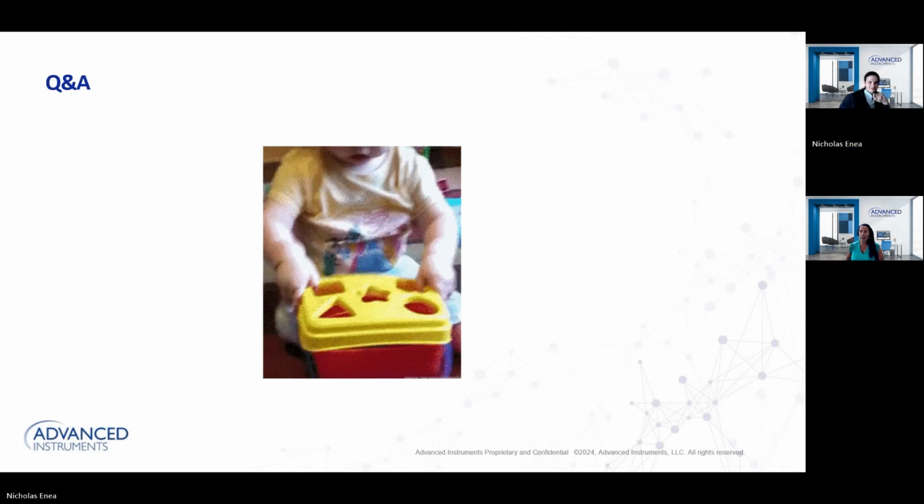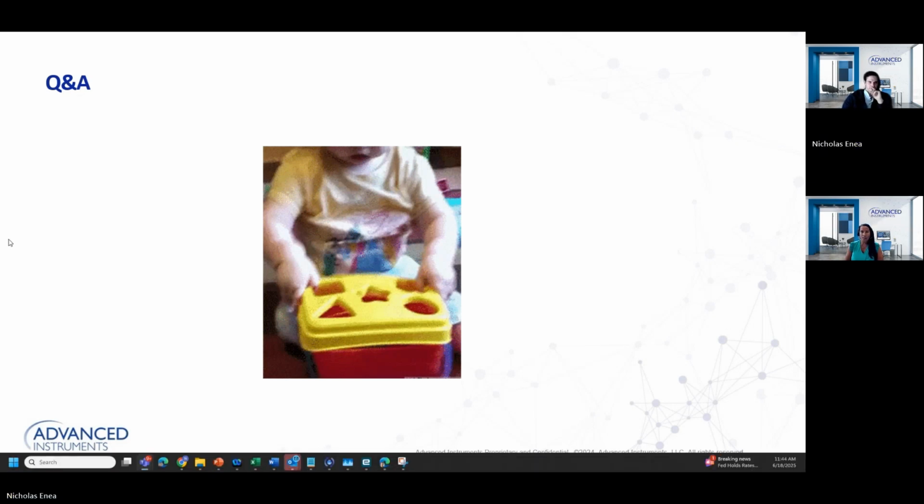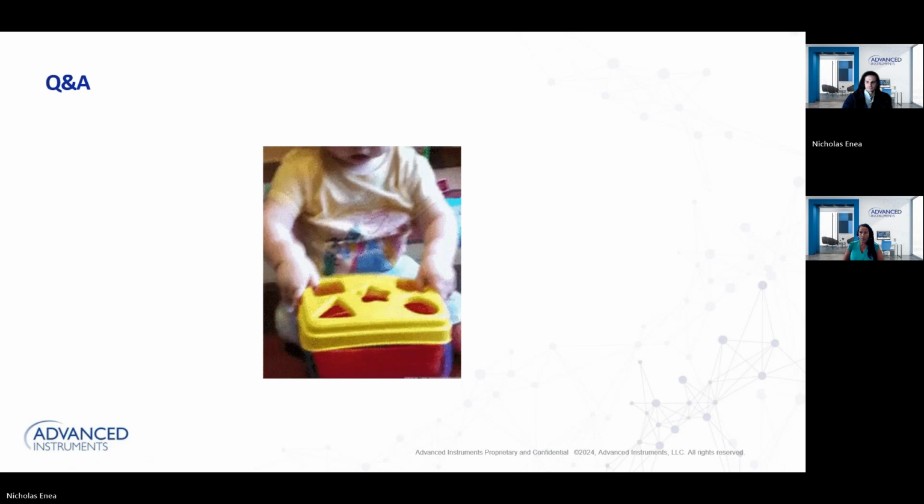Sure. Nick, I just wanted to add, if I may, because oftentimes I know from a support standpoint and from a training standpoint that customers are just looking for something prescriptive when it comes to pipette calibration. There are very few standards and regulations that actually state the tolerances, or recommended tolerances. ISO 8655, as you mentioned, is one of those standards that has a table of permissible errors.